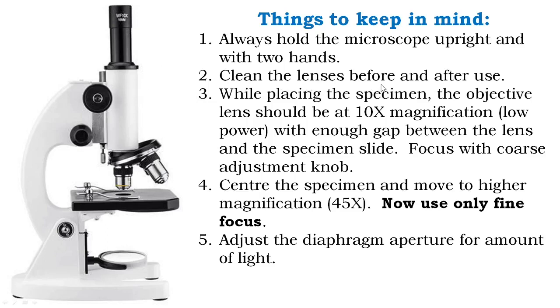And then always clean the lens before and after use. Lens dike kharche gore, you have to always clean the lens before and after use. Tanga jo re sob so jo re di pheju chen ni tanga so yugo gore. Di tanga ma so yubi yimba yana, sometimes you just see artifacts.